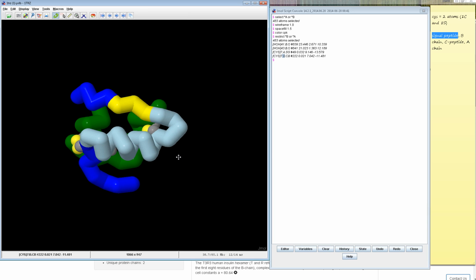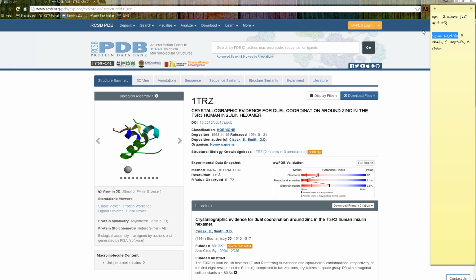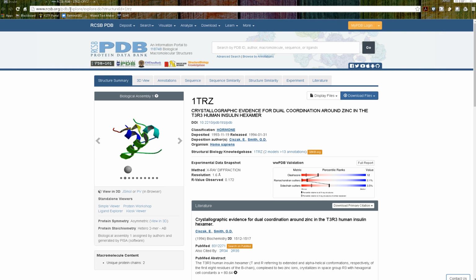So that's enough of the intro. I see I've talked for almost 8 minutes. Let's get going. I'm going to clear my screen and minimize all this. Let me show you how I got here.